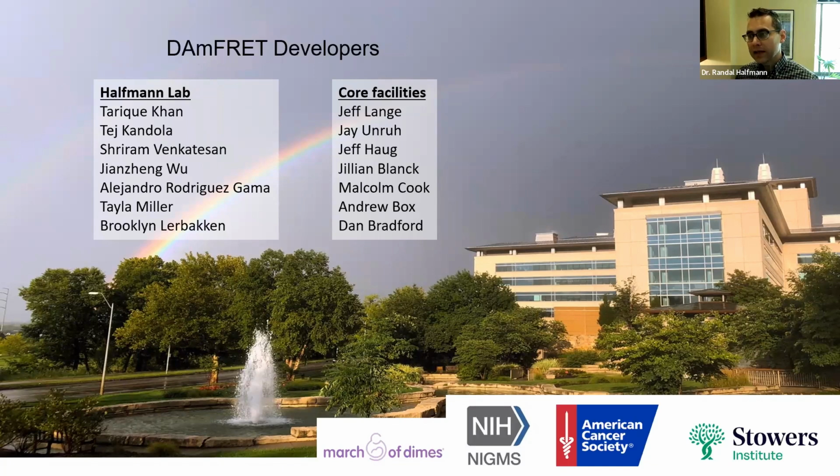And so again, and this is something that my lab is really excited about, in principle, if you mutagenized your sequence deeply enough, and you can do that because it's a single genetic construct, and then you sort all the species that have the right characteristics, at the right concentration, and you sequence those, then you have suddenly thousands of sequences that specifically form the structure of interest, hypothetically, depending on how confident you are that they are forming that structure, and a whole bunch of sequences that don't.